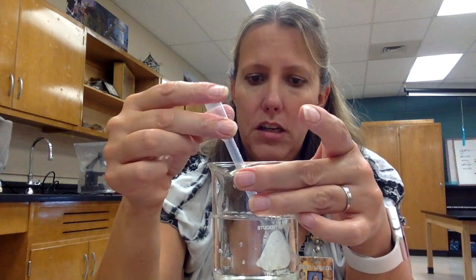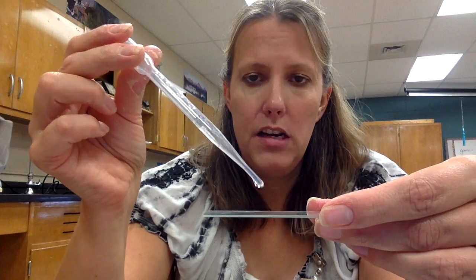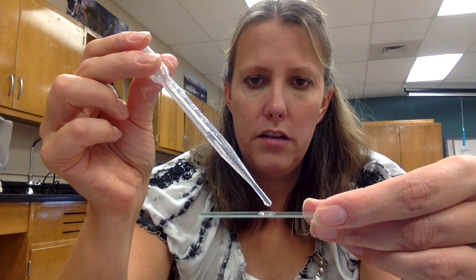So you're just going to squeeze in a little bit of liquid from that. If you can see a little bit of dirt or plant material in your dropper, that's a good thing, because there's probably some things living on that. And you're going to take your microscope slide and put one good drop of pond water on there. You're going to put a cover slip on it and you're going to look at it.